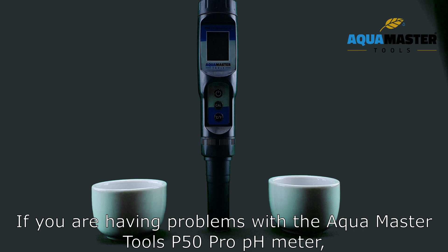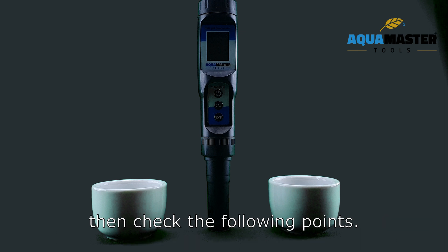If you are having problems with the Aqua Masatoos P50 Pro pH meter, then check the following points.